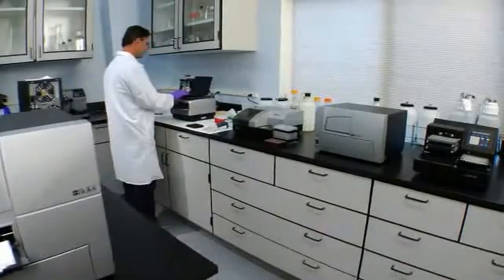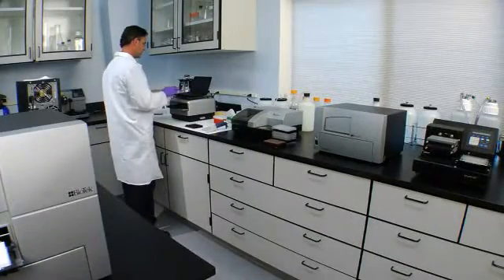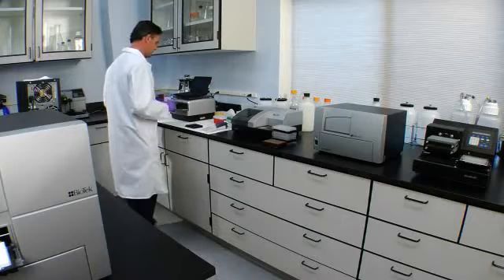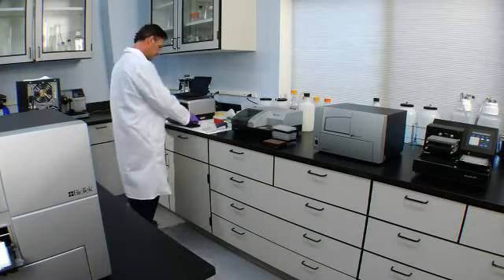Today's laboratories are searching for ways to use lower reagent and sample volumes while increasing throughput and efficiency to keep costs in check.